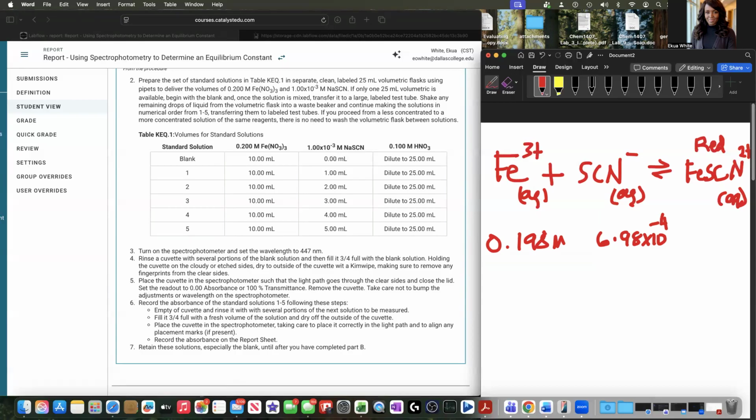So I tried to be proactive and figure out the new concentration in water. And just so you know, I use M1V1. I'm going to show you how the first one is done. This is the actual concentration, right? But in the M1V1, I use the original amount, which was 0.2. So M1V1 equals M2V2.